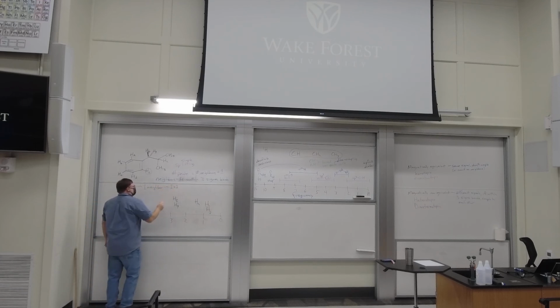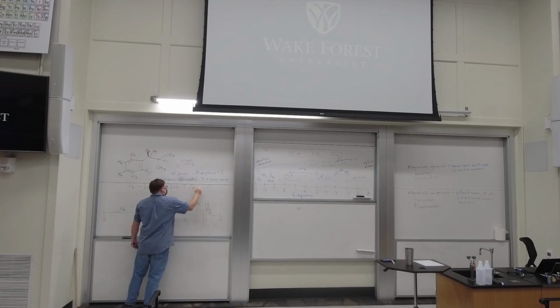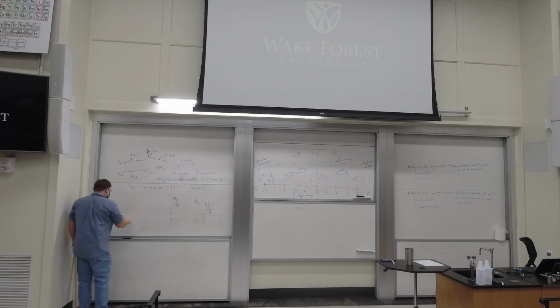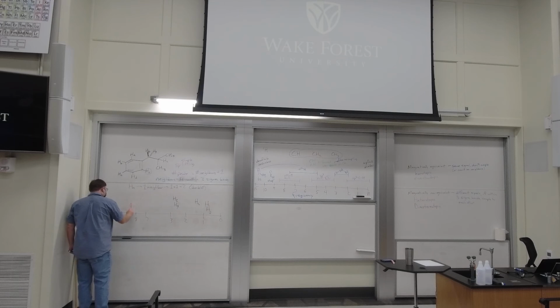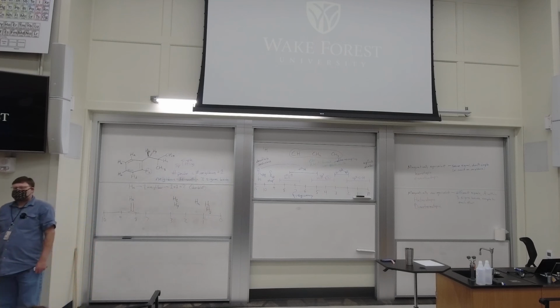One plus 1, carry the 1, 2. All right, that's going to be a doublet. So HA is going to show up in here. Kind of cramming this together, aren't I? HA will be a doublet. Again, doublet is going to be 1 neighbor, and the neighbor can oppose or reinforce.